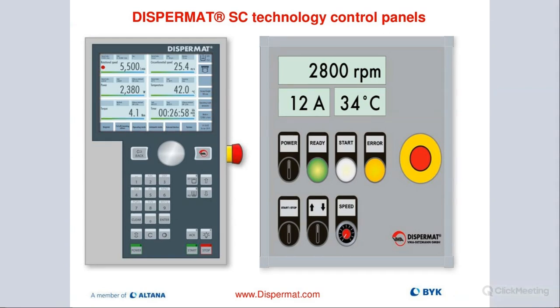So then we have the quality control aspect. On the left here, you see that C technology, very well laid out. On top, you have your RPMs, top left. Then you have the amount of energy you're putting in. As you can see, the red dot is next to the RPM, meaning that we're running here with constant speed, and the machine will adjust the power that it needs to maintain that speed. But again, on the C technology, it can also run with constant power, where then the machine will adjust the speed. Then below that, on the bottom, we have our torque value expressed in Newton meters.